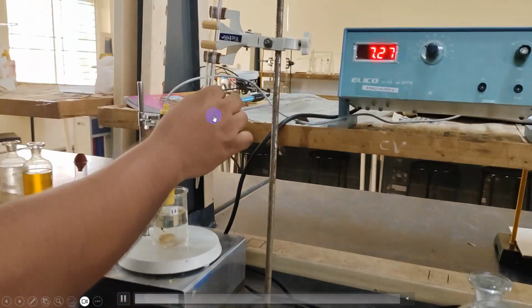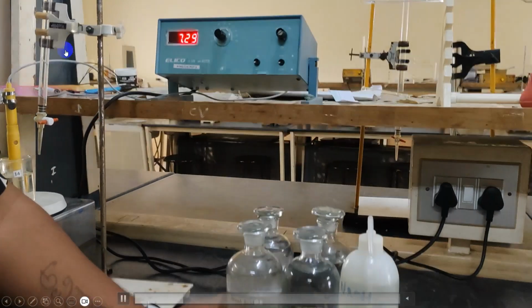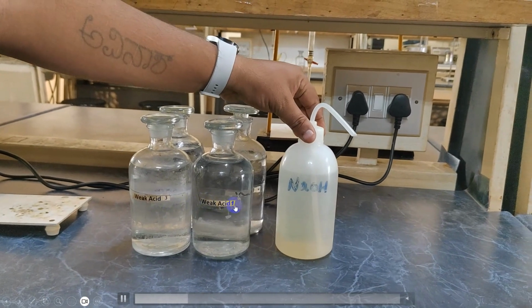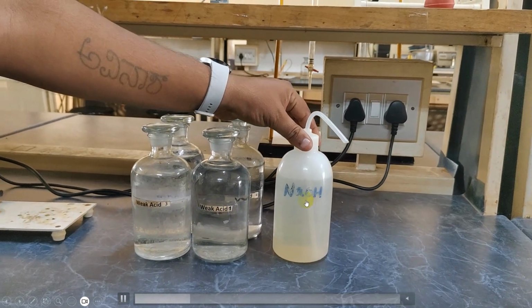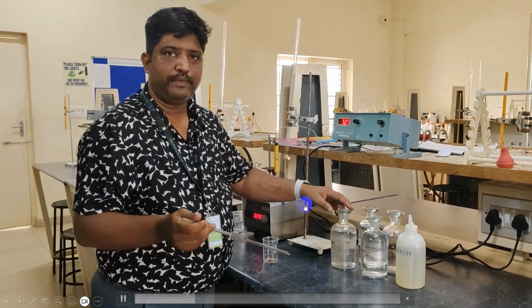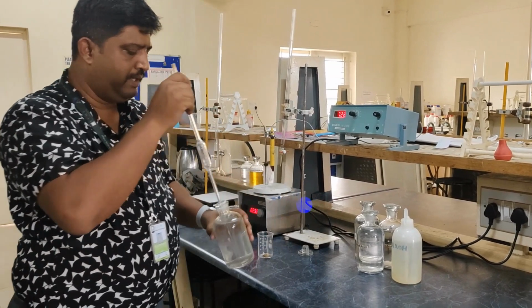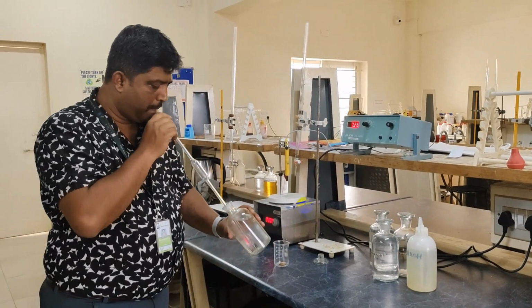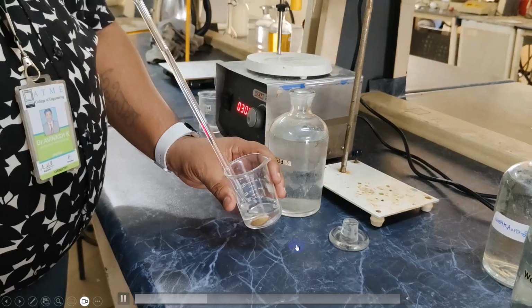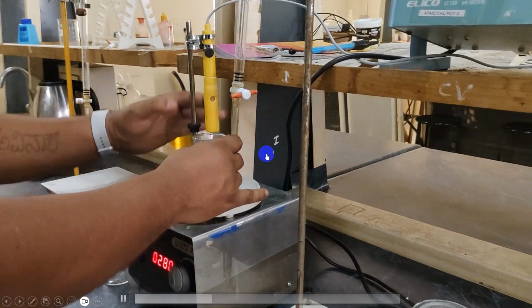Now what we do, we are having a microburette to which we are going to fill the standard sodium hydroxide solution. We have the weak acid, and we have already prepared the standard sodium hydroxide solution. Now pipette out around 50 cm cube of this weak acid and transfer it into the beaker.